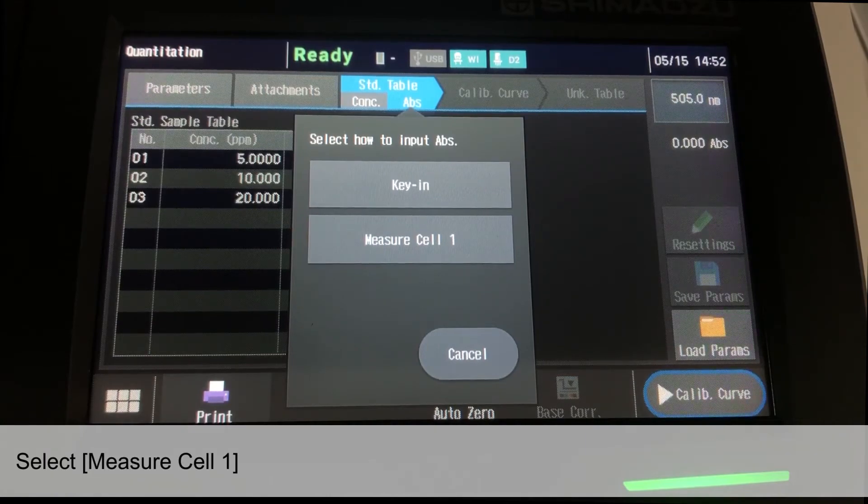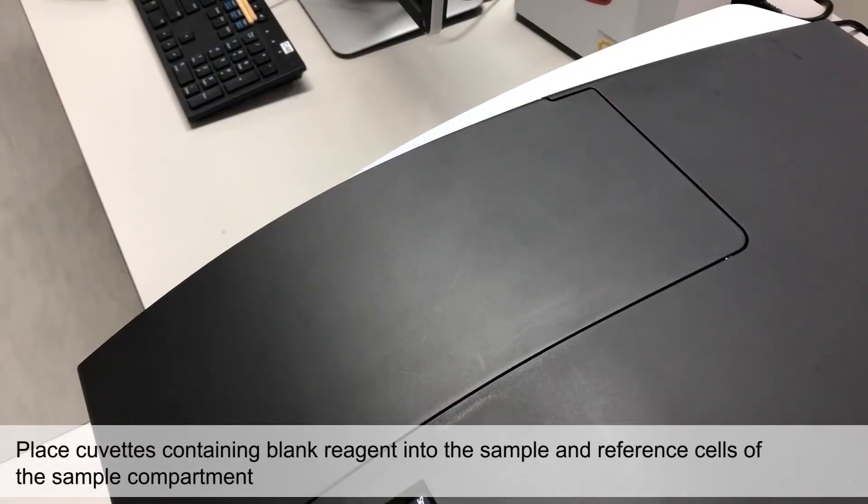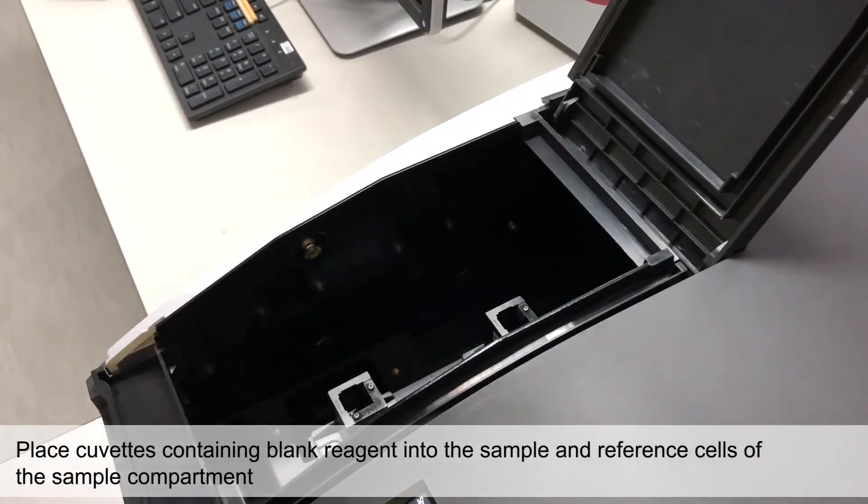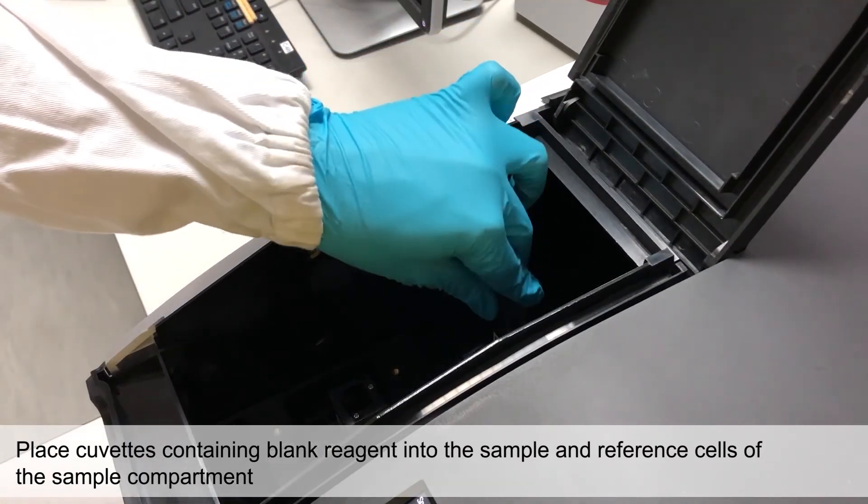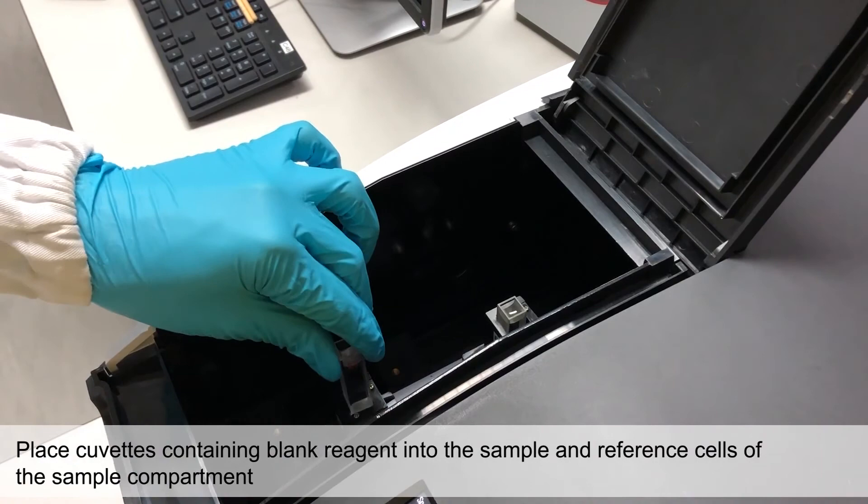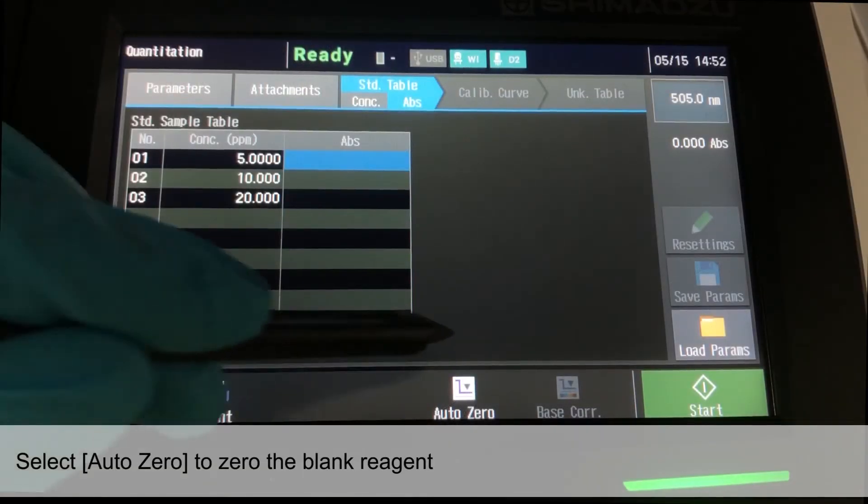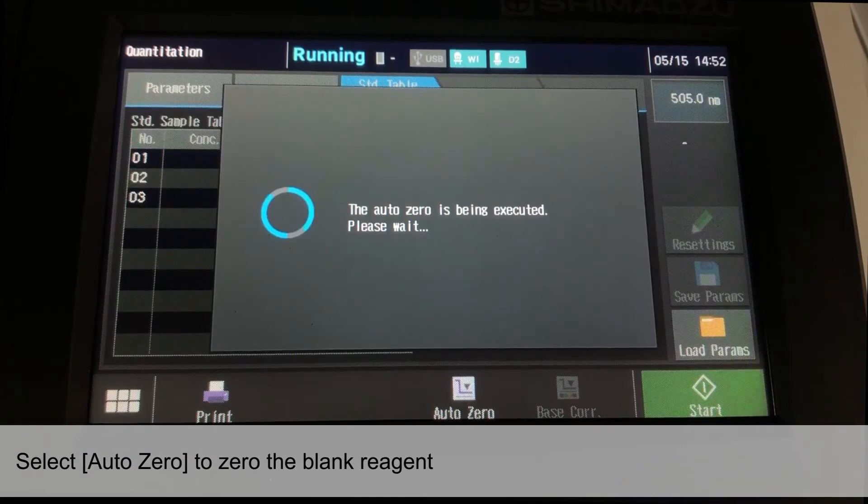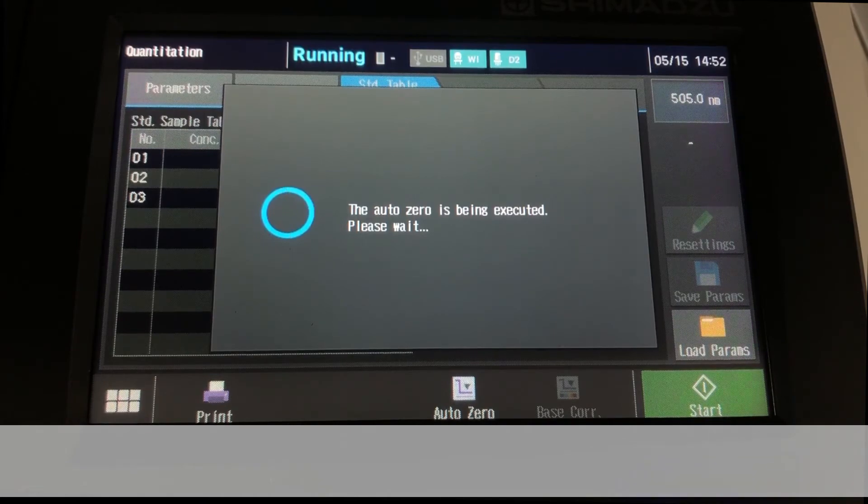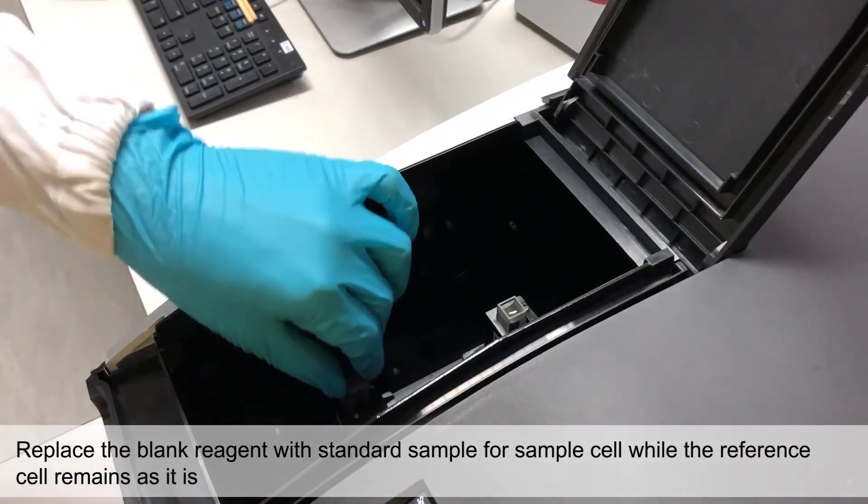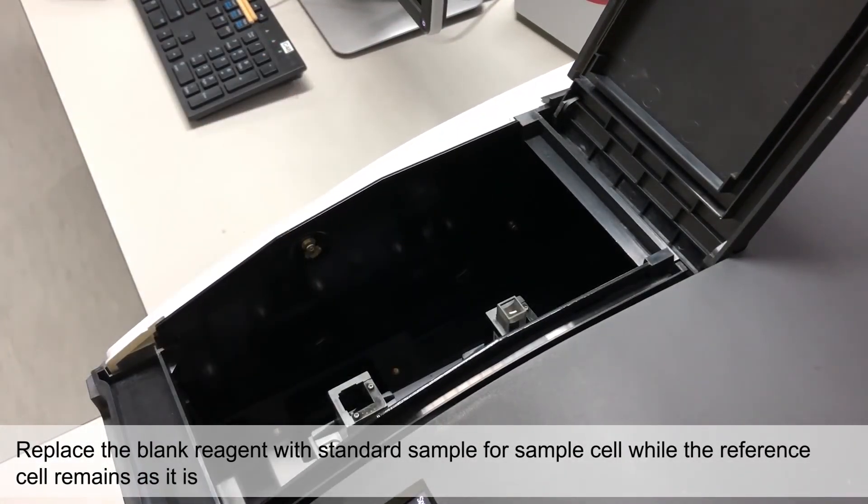Select Measure Cell 1 for Standard Sample Absorbance Reading. Now, place the cuvette containing blank reagent into both sample and reference cells of the sample compartment. Select Auto 0 to zero the blank reagent. Once finished, replace the blank reagent with the Standard Sample for the sample cell.